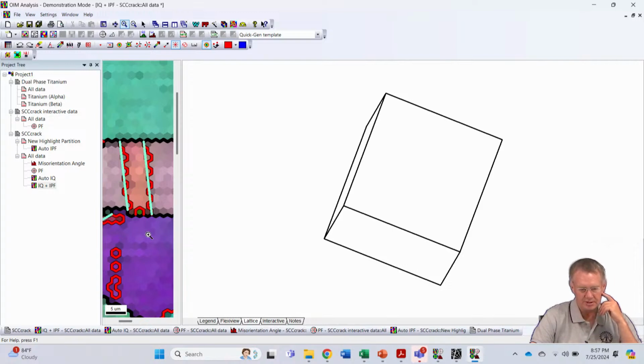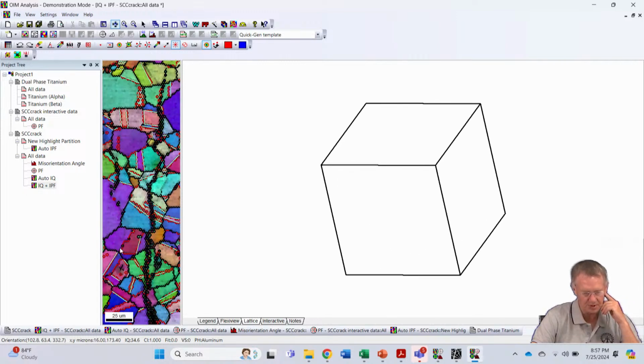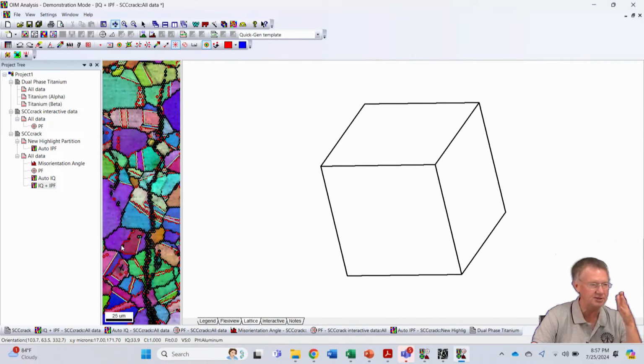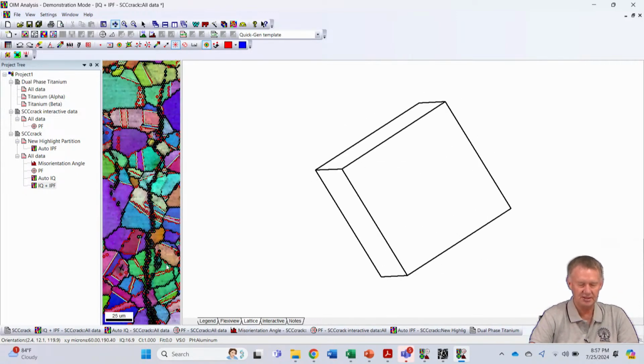So it's drawn in and said these are within 10 degrees, how this boundary is drawn up here. That is within 10 degrees of where the actual twin should be. So you can come in here and look at where the coherent and the incoherent parts are. If we zoom out, here's a boundary that's jumping around, so it probably has coherent and incoherent parts, but as it's looking along there, it says that's not within 10 degrees. So it classifies it as incoherent.